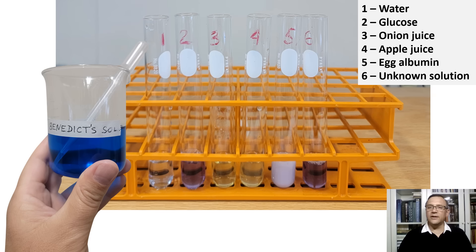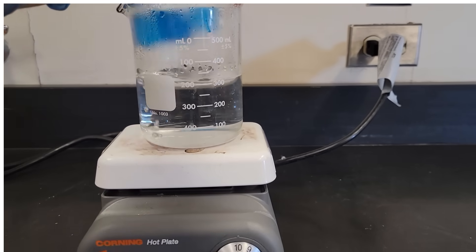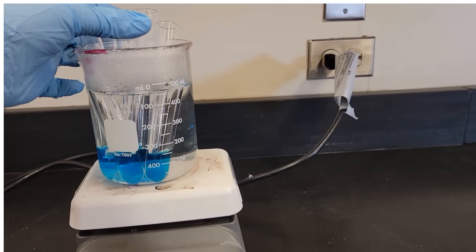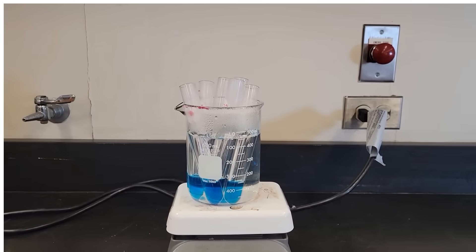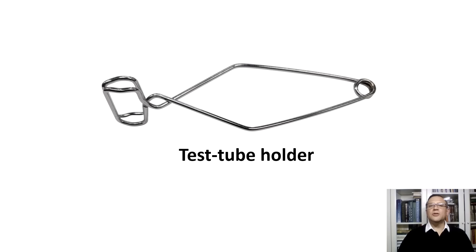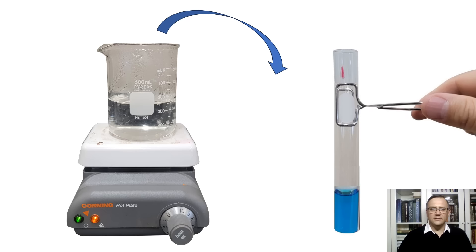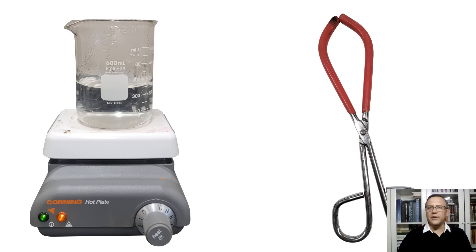We have added two milliliters of Benedict's reagent to each of our controls and food samples. Initially, nothing happens — there are no visible changes. For the precipitate to form, we need to heat our solutions. The water is boiling, so we will place all our test tubes inside the beaker simultaneously. After five minutes, we carefully take our test tubes out of the beaker using a test tube holder. Let's turn off the hot plate and remove the beaker using tongs.